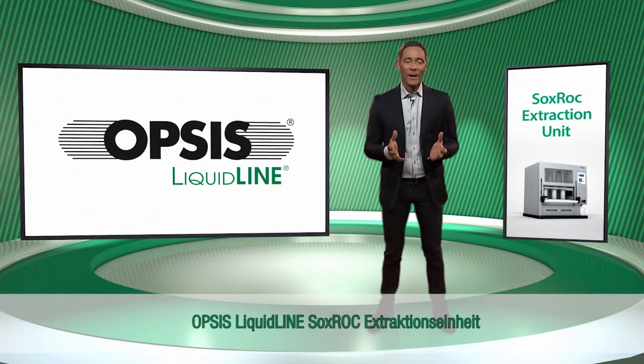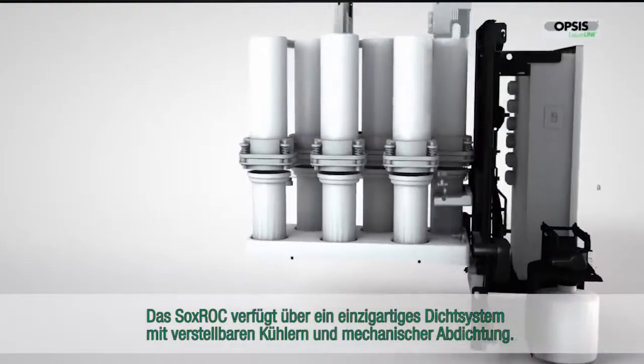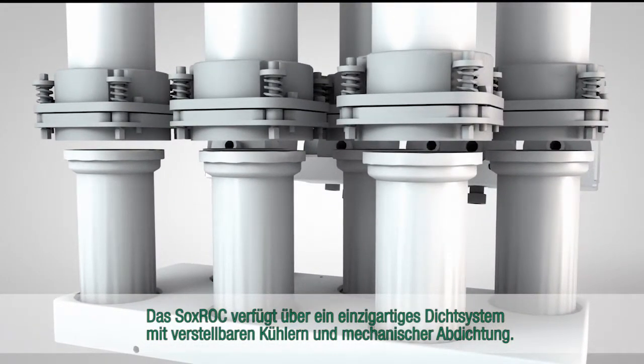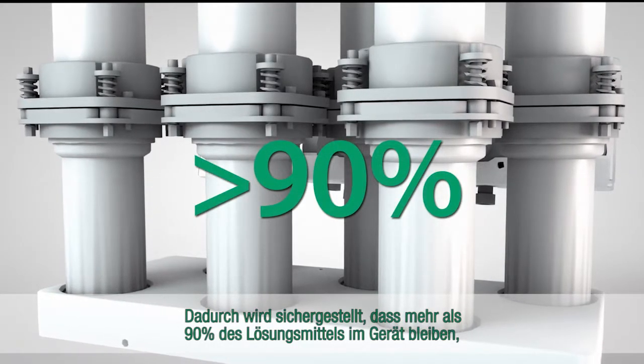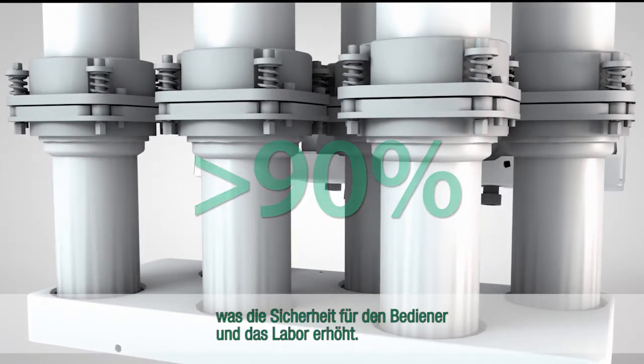The Opsys LiquidLine Soxrock Extraction Unit has a solid construction and includes several built-in safety features. The Soxrock has a unique sealing system with adjustable condensers and mechanical sealing. This ensures that more than 90% of the solvent stays inside the instrument, which increases safety for the operator and the laboratory.